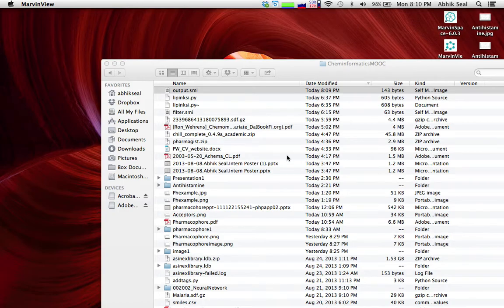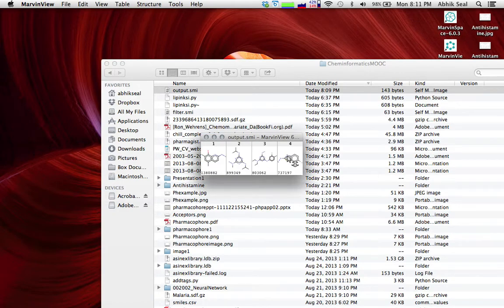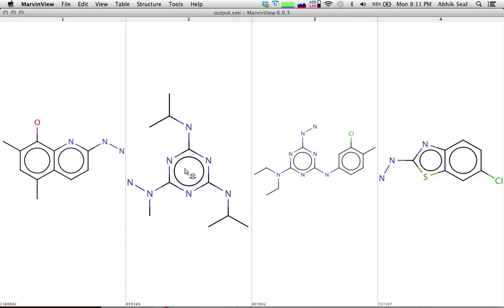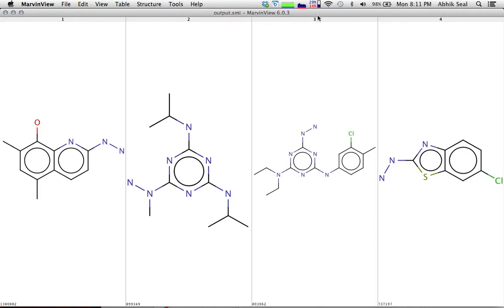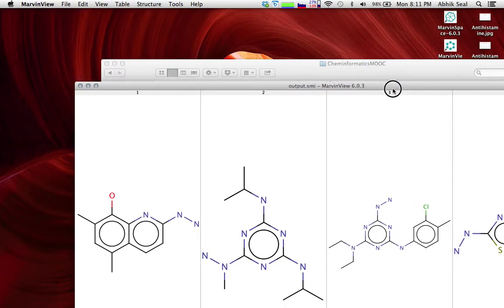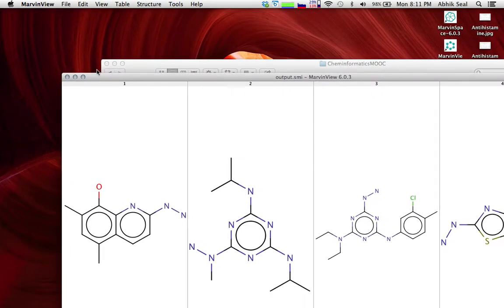You can see these are the four molecules — they have that SMARTS pattern inside — and these four molecules might show mutagenicity in your bioassay dataset.